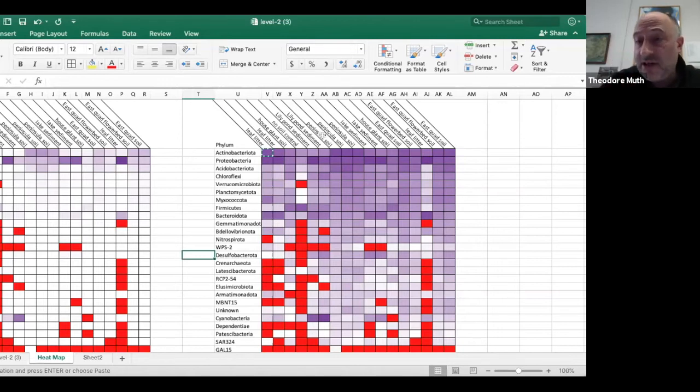And I haven't done that, but you can do that. I've got them just clustered by what type they are, but you can use phylogenetic measures or other metrics to cluster those things. So maybe you want all the soils next to each other, and that will make it easier to see the patterns, because the really crucial point, which I think a lot of people miss, and this is an excellent question, is that if you don't have your axes sorted properly, it's harder to see the patterns.